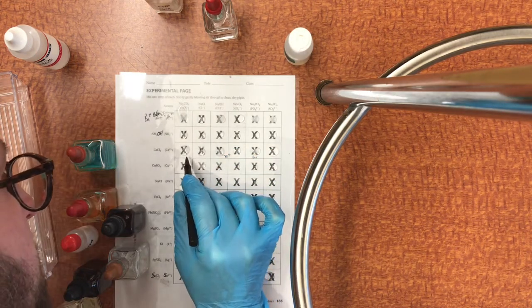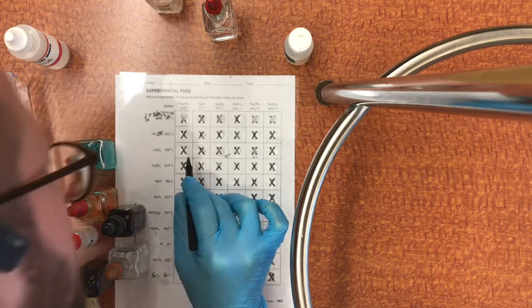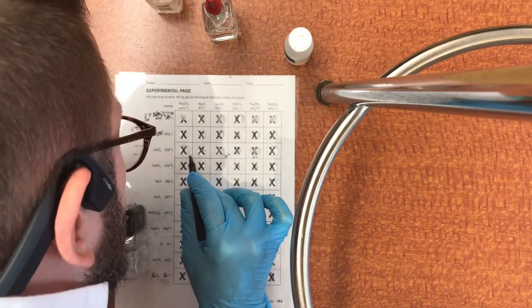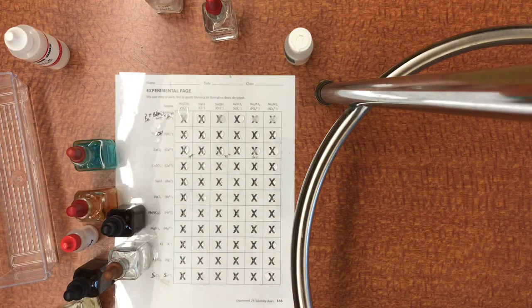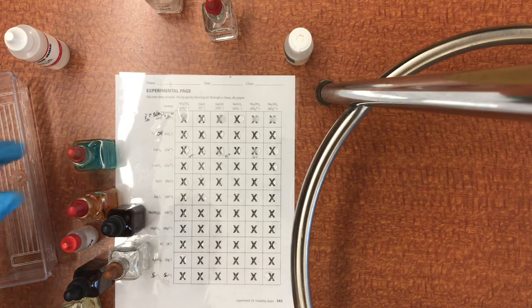And the carbonate, there might be a little bit. I'm going to go with a slight PPT on the carbonate, but not very much. Okay, so that is interesting because I think in our rules, calcium should have formed a reaction with the sodium sulfate. But that sometimes depends on the quality of the solution, so the solution might not be strong enough.